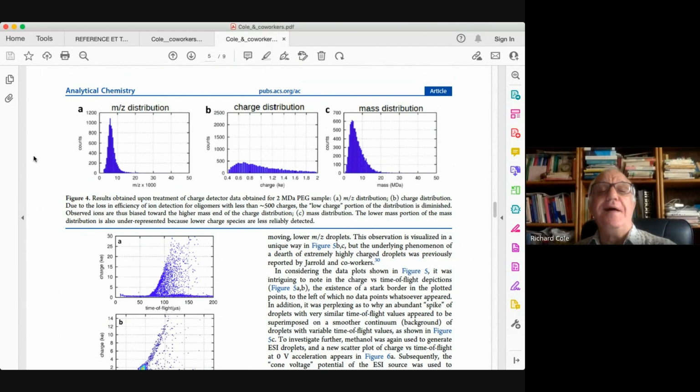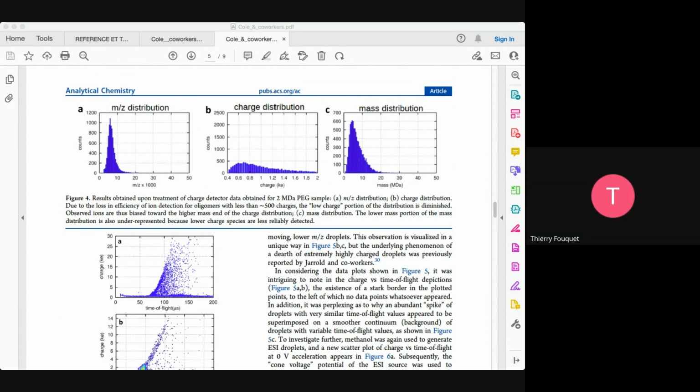Oh, I thought you were talking about the polymer values. No, okay. I mean, like the V0 value. I don't realize actually how fast my ions are moving in my mass spec. Does this value make sense to you? I'm really ignorant on that value.